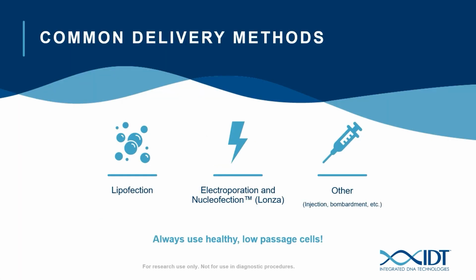Now, I would like to discuss the delivery approaches for the RNP system. Generally, the RNP can be delivered through different approaches: lipofections, electroporations, and microinjections. Each of these delivery methods possesses its own advantages and disadvantages, which I will discuss in detail.